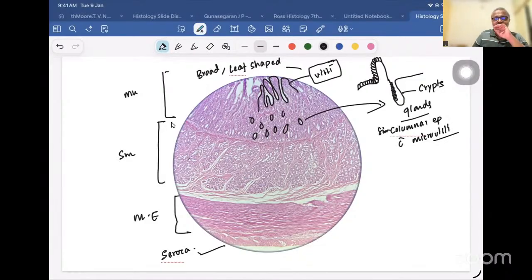Now, here we are coming across the term microvilli. What do I mean by the term microvilli? Remember, if I take one columnar cell, a simple columnar cell will look like this. It will have a nucleus.